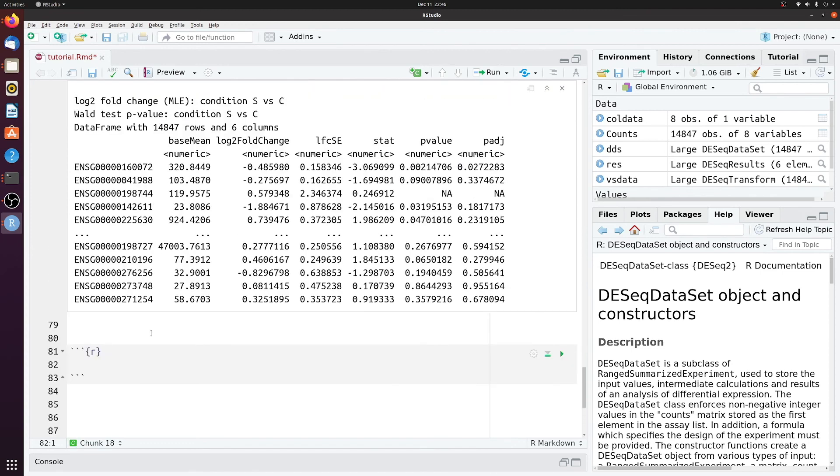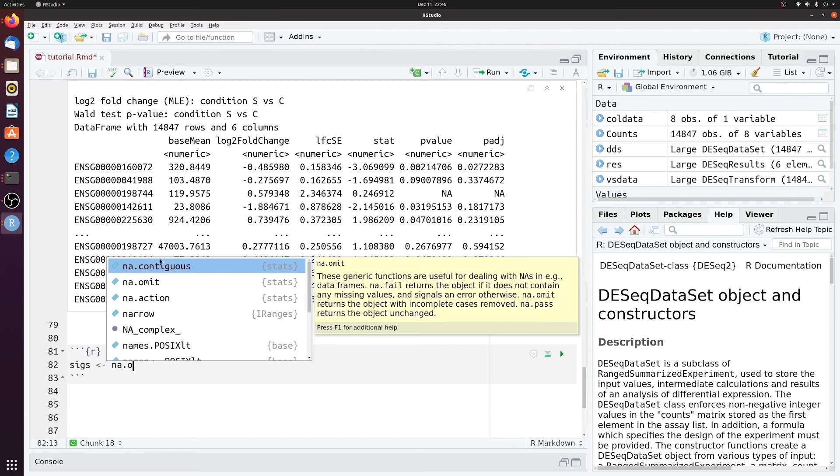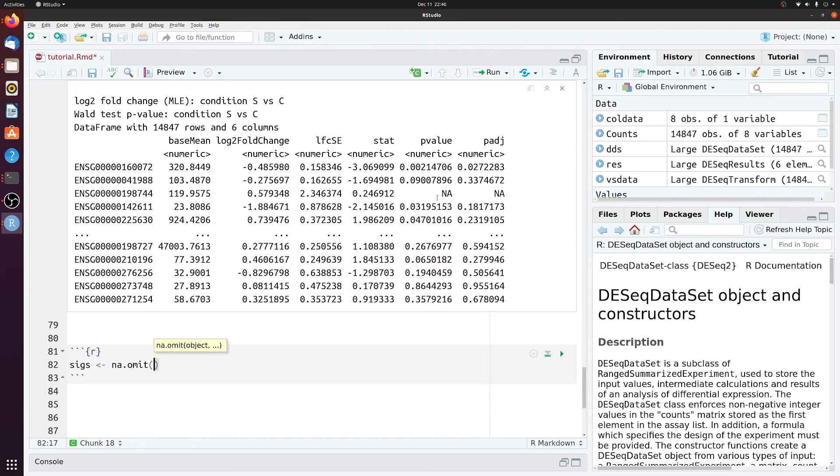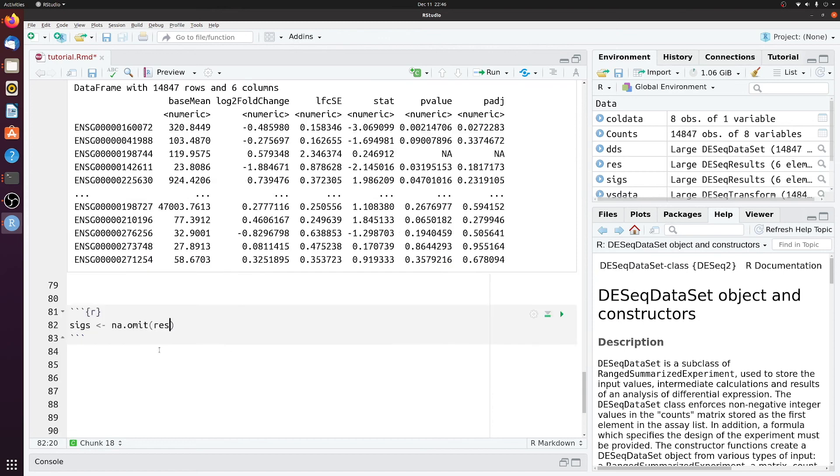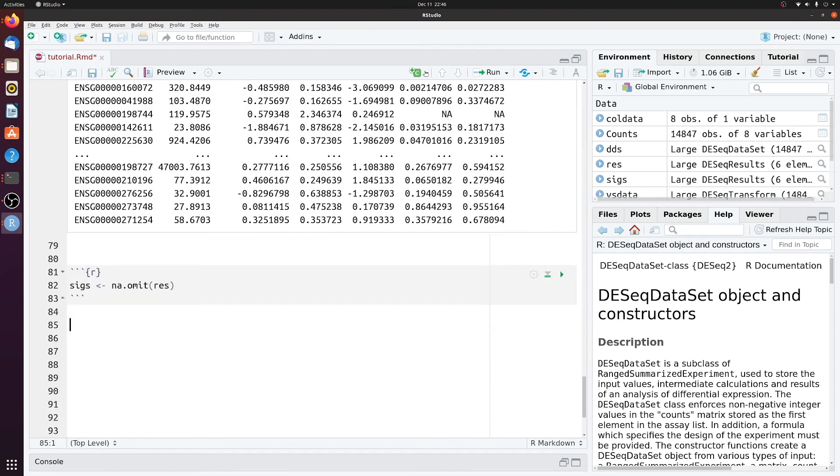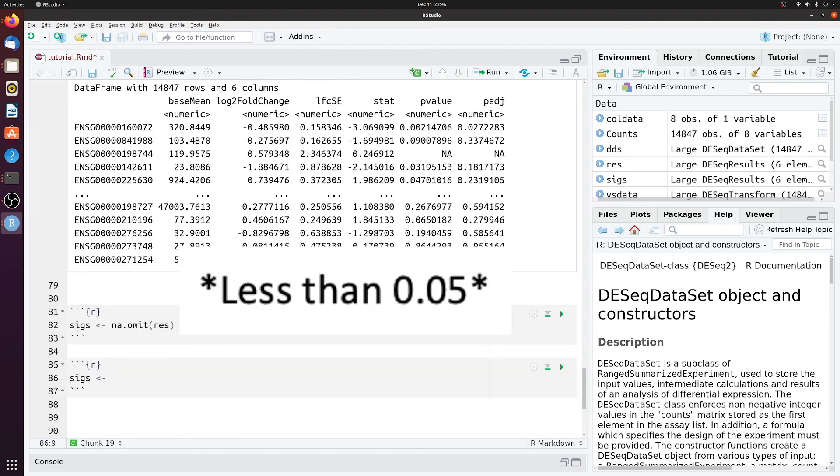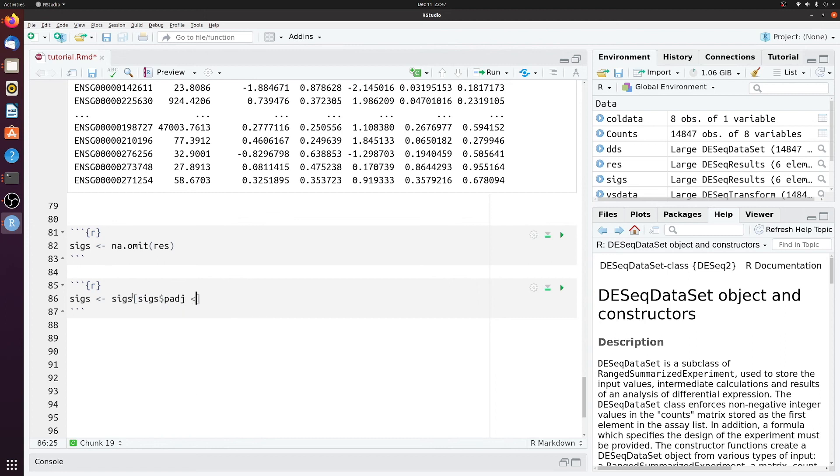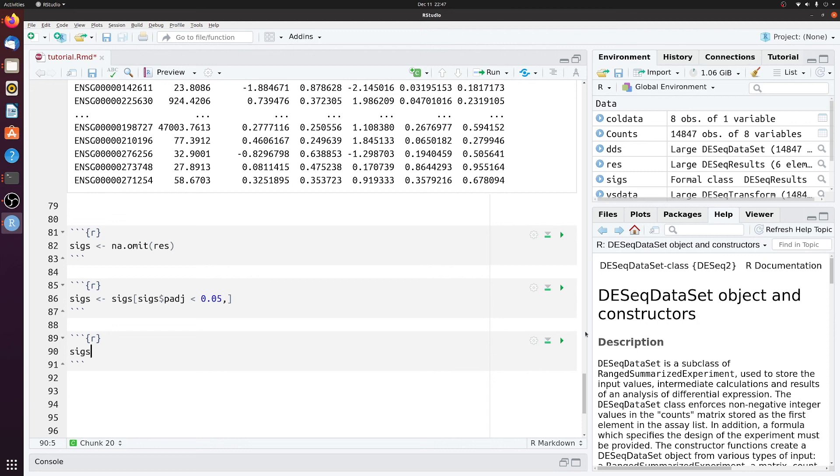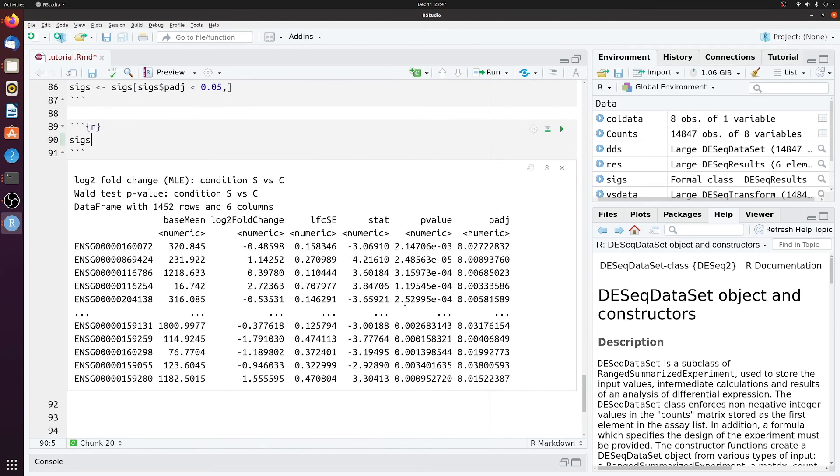So we can filter this further. We'll just make a new table called sigs, so significant genes. Well, let's first drop the NAs. You see this row, for example, has NA. And then we can filter out all the genes that adjusted p-value of greater than 0.05. So sigs p-adjusted less than 0.05. And now if we look at sigs, we see that there were 1,400 genes that passed this threshold.